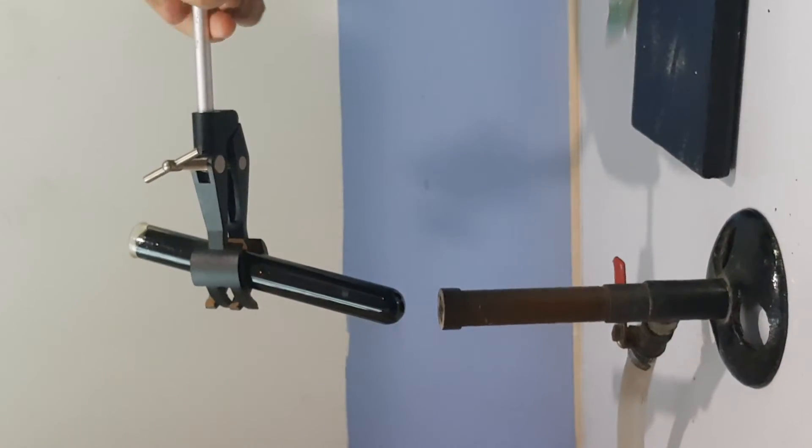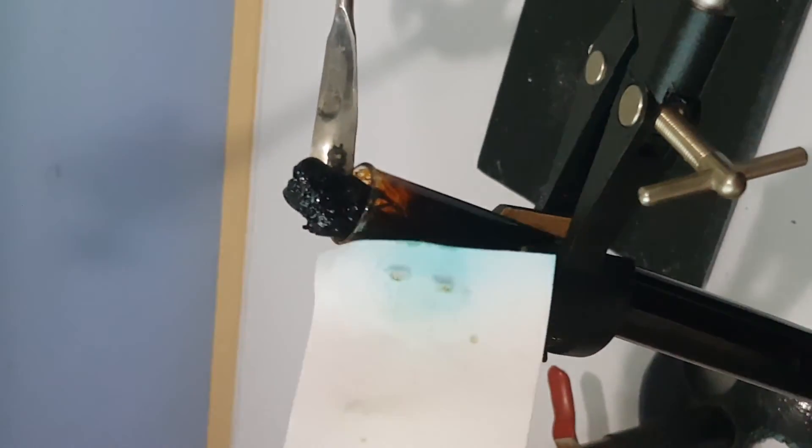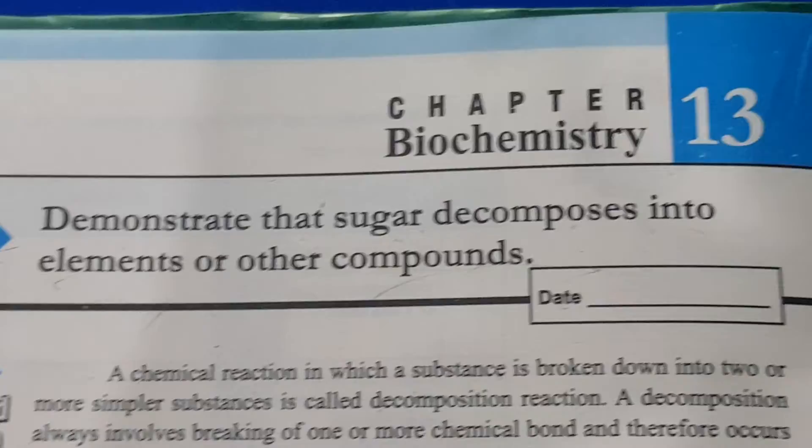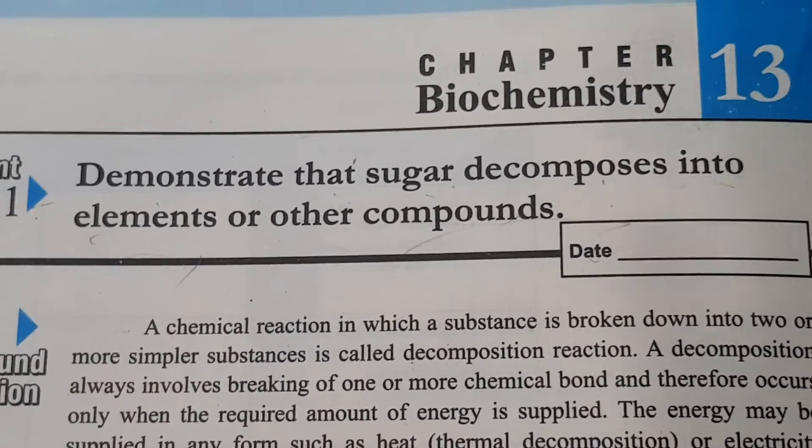You can see carbon black and the presence of water vapors. Hence it is shown that sugar decomposes into elements or other compounds.